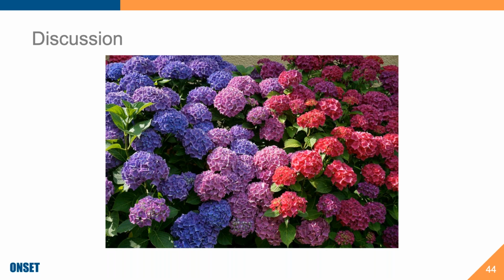Is the use of a central wiper safe for the electrode on a multi-parameter sonde? That is a question that I think is subjective, unfortunately. The manufacturer obviously believes that it is, and that's why they have it, and that's why they recommend it. I've heard issues with the wiper in that it can freeze, and one customer said to me, you better hope that it doesn't freeze on top of your electrode.